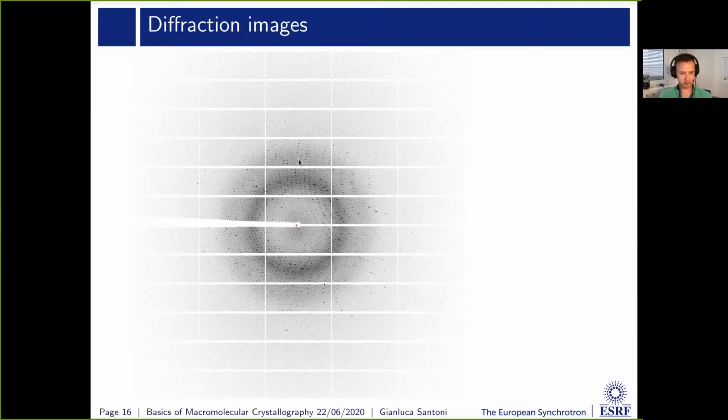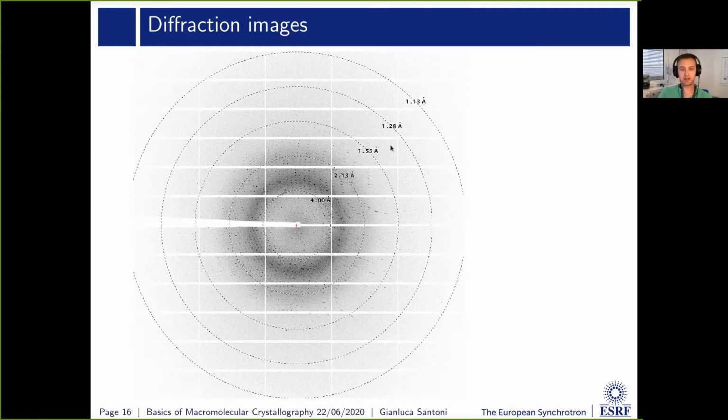This is collected, if I remember correctly, from a Pilatus detector, and the Pilatus is a collection of sub-modules. And each sub-module has its own electronics, but then there are blank regions when we connect the modules to each other. As I was explaining before, the higher the angle of exit, the farther the diffracted beam will intersect the detector from the center of the detector itself, the higher the resolution.